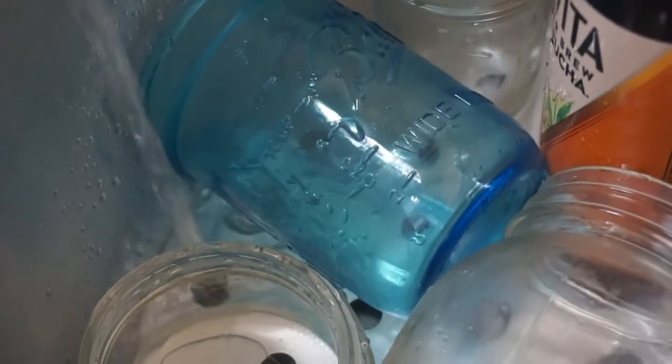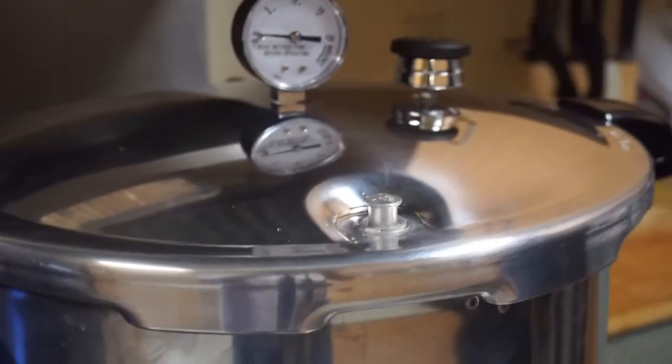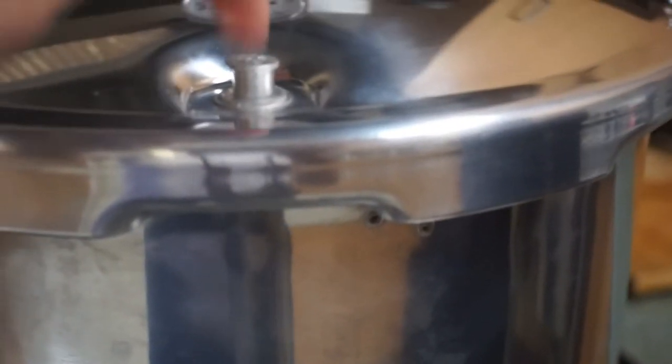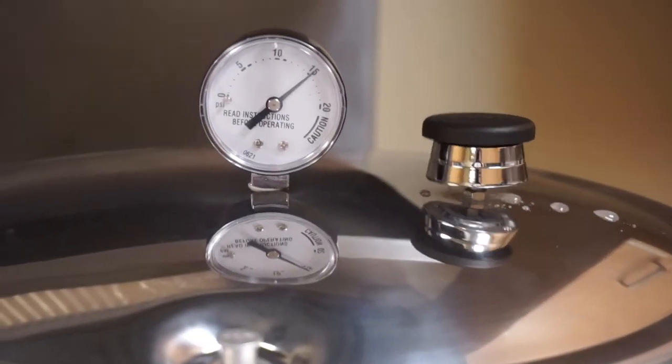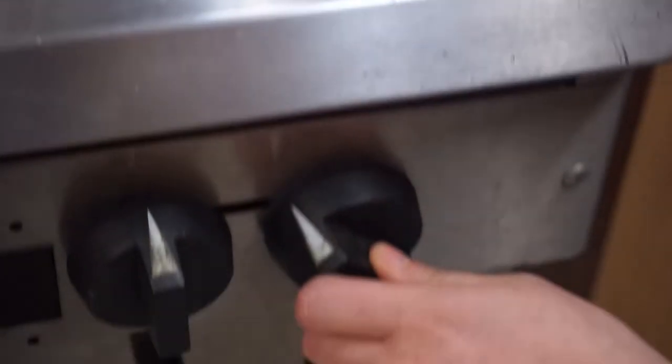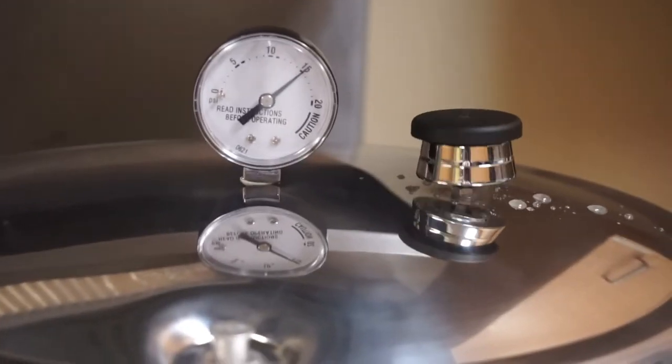Next, fill the pressure cooker with enough water to where you can see it at the canner rack. Now you can pressure cook for 45 minutes at 15 psi. Once pressure has reached 15 psi, adjust heat to maintain this pressure. Do not let it rise above 15 psi.